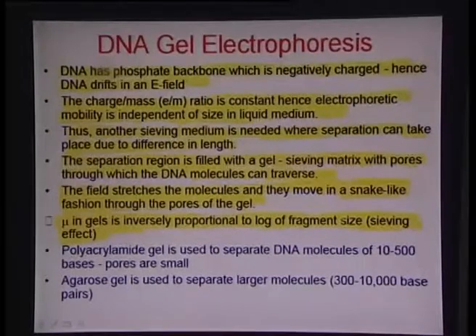In that case the channel size is much smaller, about 10 or 20 nanometers, and therefore that gel is more clear because it essentially holds less water. So there is less scattering of light. Agarose, on the other hand, is a very milky, very turbid medium because of the presence of a large amount of water. Mind you, in media like agarose, the pore size distribution is roughly about 100 nanometers plus or minus a few tens of nanometers. It's about 10 times that of F127 or other smaller pore media, and that is one of the reasons why the light gets heavily scattered in a medium like agarose.